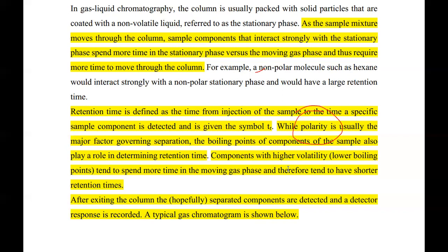The polarity of a sample, especially a solution, may not be understood easily, because you have to do a little bit of structure elucidation. How are the atoms positioned in this compound, or what's the dipole moment, the bond order, and all that. Maybe let me not talk about it, because you may not have information like the bond order and the dipole moment.